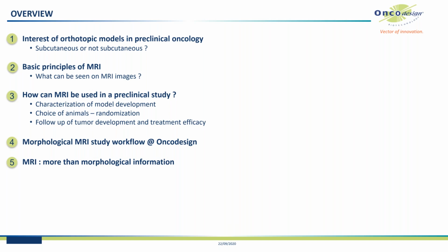I will start by an introduction on the orthotopic models and some basic principles of MRI, just to let you understand what you can see on an MRI image and how you can do this.